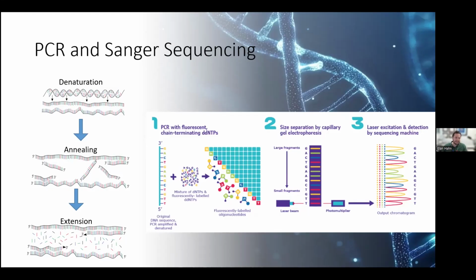And then there's Sanger sequencing, where you have varying, increasing lengths of fragments within our sequence, each signified by a fluorescent probe. And then reading the fluorescent probe of the different length segments, we could rebuild our sequence, as you can see under number 3.